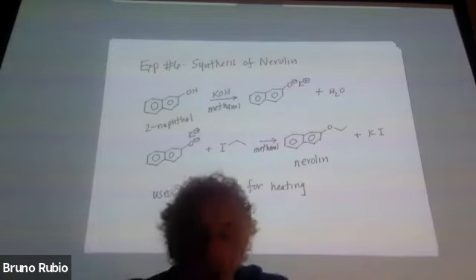And so if we were doing this experiment for real, what we would be using is this microwave tube, and this is where the reaction mixture would go in. And this microwave tube, this is what goes into the microwave oven. It's made out of Teflon, and that turns out to be a very important design feature.